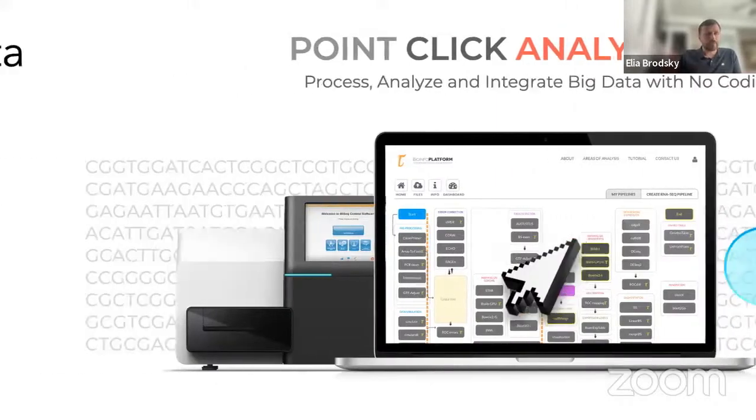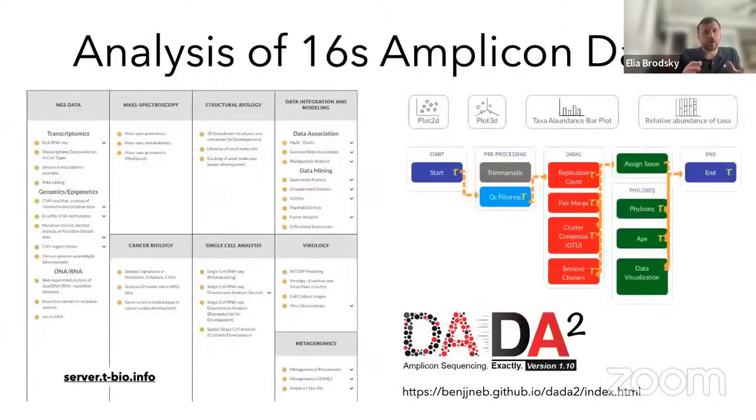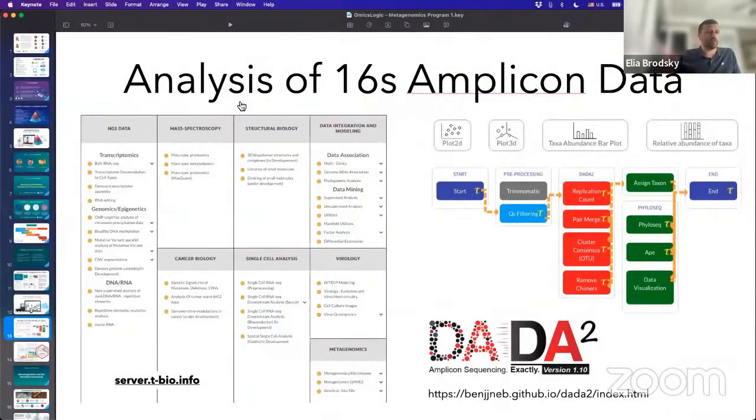So to demonstrate how this is used in the context of metagenomics, I will show you a brief example, and then we will talk about how that can be used either to study metagenomics or to understand the relationship between phenotype and the specific types of data that we will be working with. So let me transition from my slides to the actual portal.